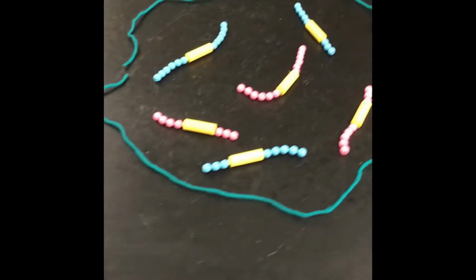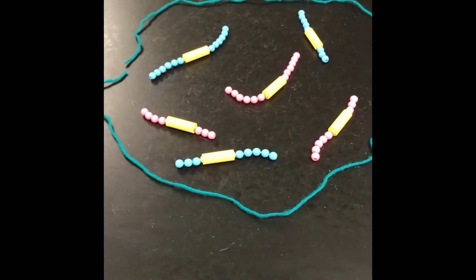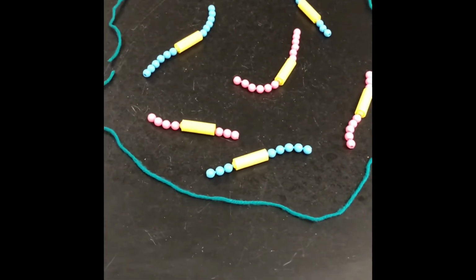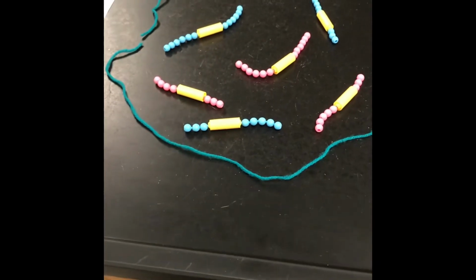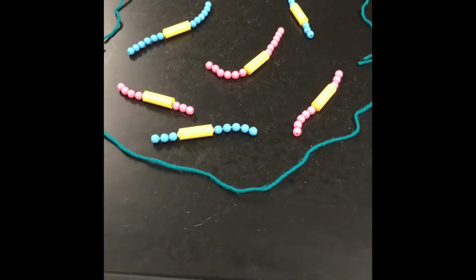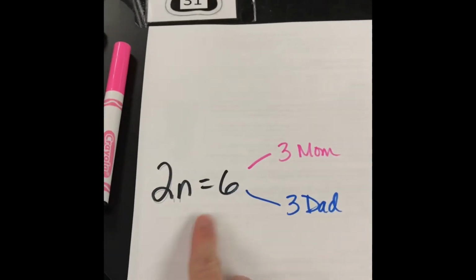How cool is that? Okay, so now for the tough one. We're ready for meiosis now. Instead of producing somatic cells that are diploid at the end, we want to produce haploid sex cells. The intent is to produce sex cells for the purpose of fertilization. So I'm still starting with my original cell. This is a germ cell.